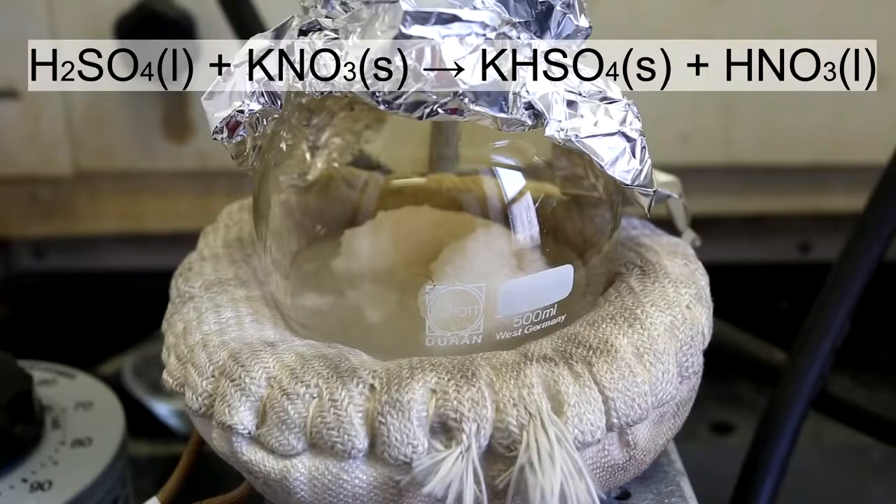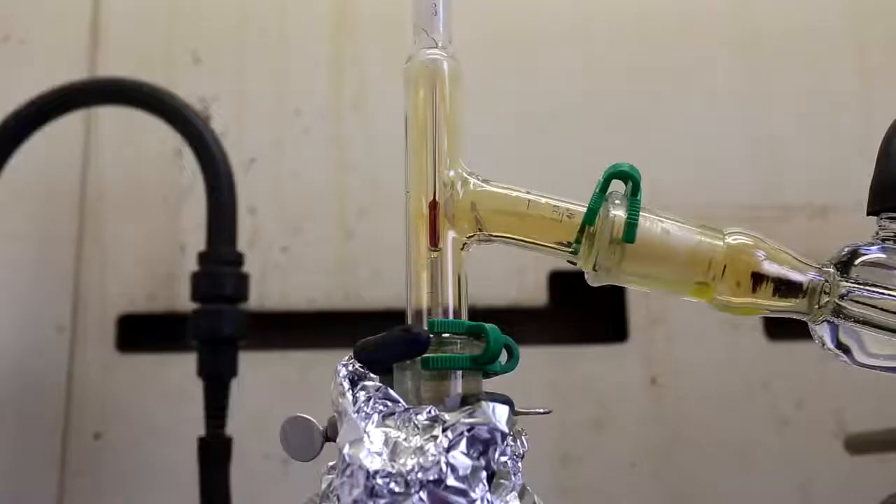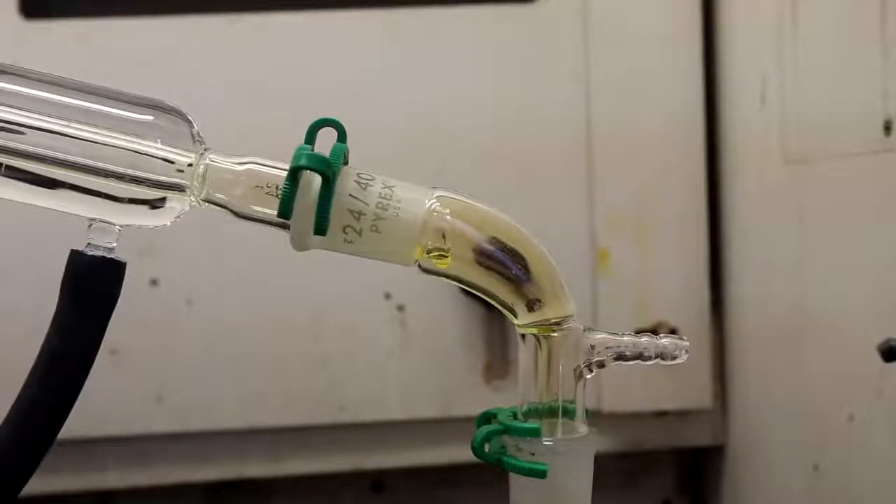In the round bottom flask, the boiling sulfuric acid reacts with the potassium nitrate according to the reaction shown. The KHSO4 remains as a solid salt in the flask whereas the HNO3 can be distilled off. It is very important to keep the temperature at around 83 degrees Celsius, which is the boiling point of nitric acid. When it first starts coming over, it might have a brown color. The brown gas is nitrogen dioxide, which taints the distillate yellow. Good control of the temperature at or below 83 degrees Celsius will limit the amount of nitrogen dioxide gas produced.